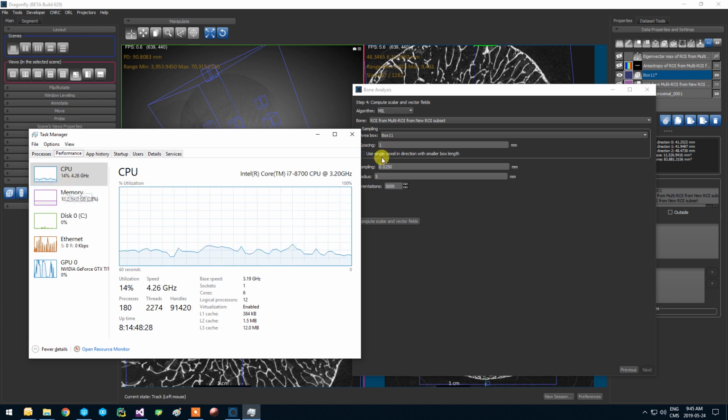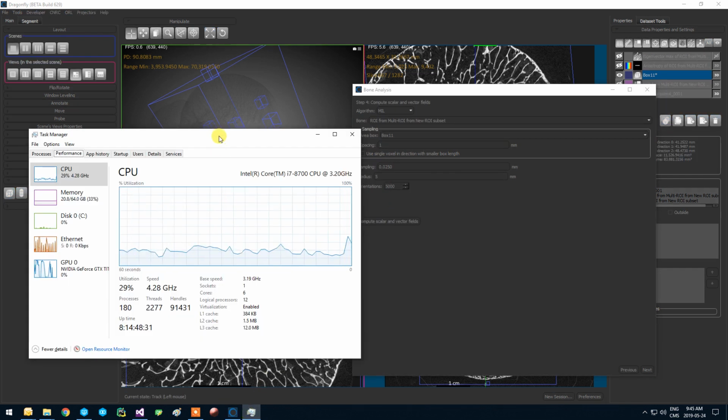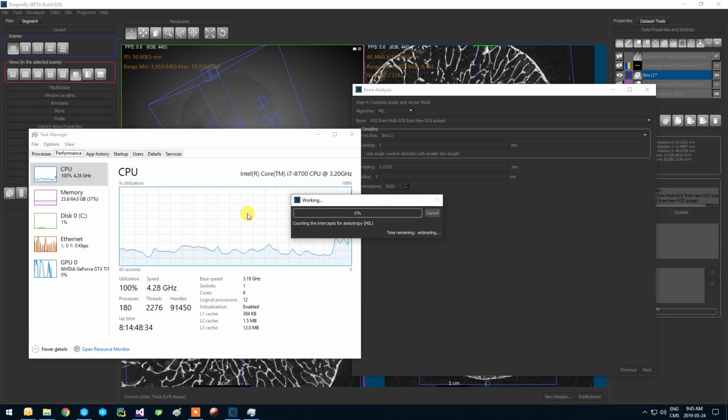18 gigabytes. Computation started. So you see there is not so much memory. It took 5 gigabytes of memory for that whole portion. Memory usage should remain stable. So I'll just pause for now, and I'll come back just before the end. It should take about 3 minutes. It has been a minute since I paused recording.